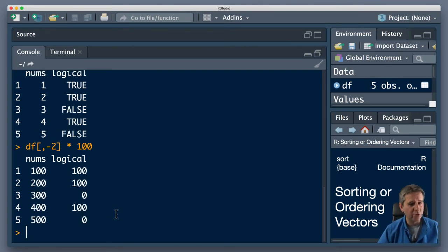I don't have to iterate through the rows and the columns and do a for loop like I would have to do in Python or something like that, or C. It's all vectorized and will work across the whole data set, which is cool because I read in my big, huge, 30,000 genes list and I want to normalize them. I can just call the function and it just does it all, right? I don't have to iterate through it. It's all done for me.